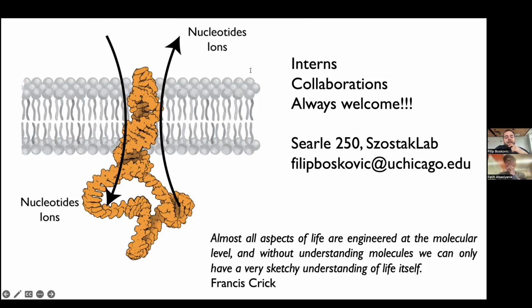So can you select against? I think not. That's what the device does. So if you select for sequence A and it reads sequence B, it will kick out sequence B in that sense. Can you select for multiple sequences? I think yes, but that's not that straightforward. You will need to look it up. I haven't done that before, but I think it probably can be coded to do so.